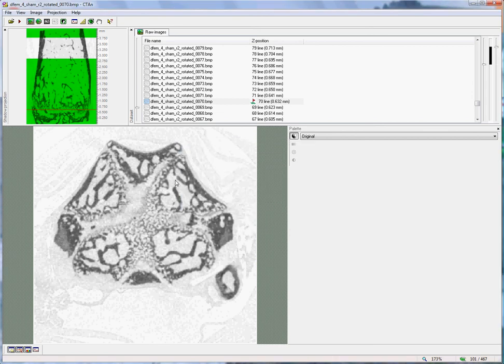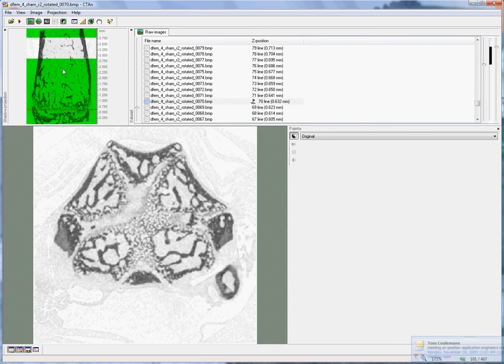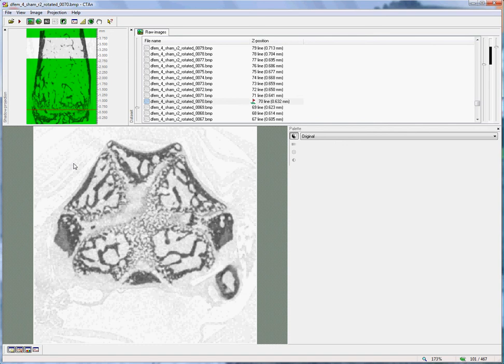I should just point out briefly that occasionally you may scan a bone which is the other way round, in which case the growth plate is at the top and the analysed region down here. In this case, you need to enter a negative value for the offset.